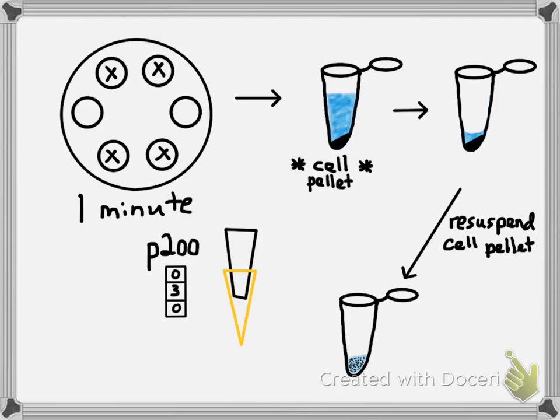Now go to the first micropipetting station. We've gone over rules for use in class, so you know not to get all plunger and ejector happy. You make sure you have a tip on, don't dial the micropipette out of the range, and don't hold it tip end up, and make sure to dial the P200 to 30 microliters. And we'll draw up some of that cell solution.